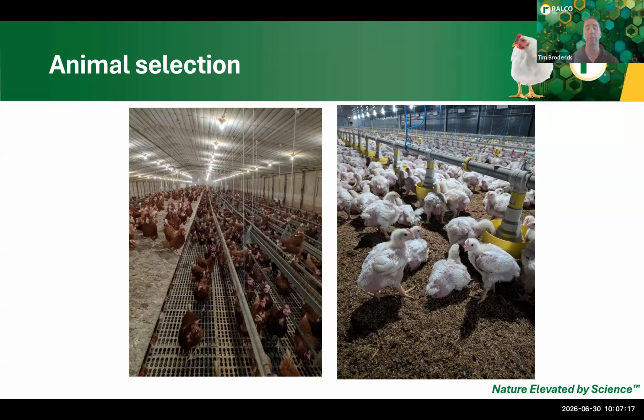We also want to look at animals that are exhibiting the signs and symptoms that have us concerned. Are birds having hock issues? We want to get some that are having those swollen or enlarged hocks. If it's some type of challenge relative to discharge that we're seeing in the eyes, we want to go and collect some birds that are exhibiting those symptoms.